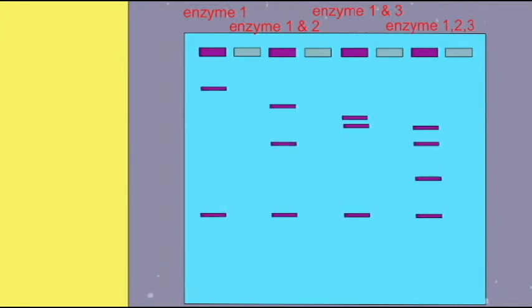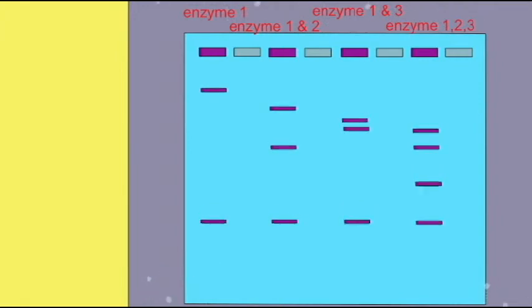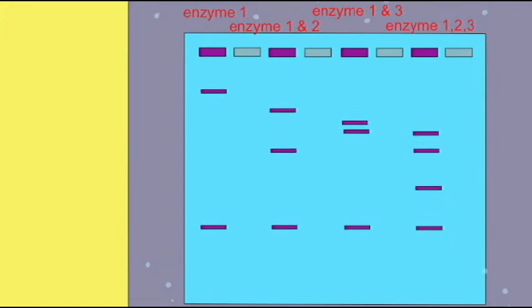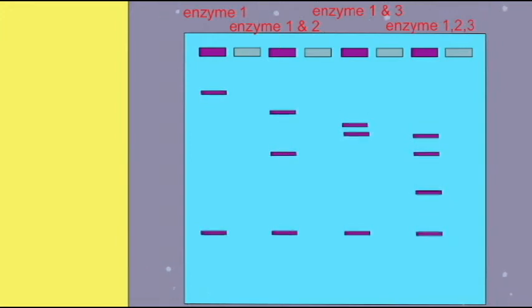So enzyme 3 makes one additional cut. Its cut is closer to the middle of that original yellow piece because those two bands are closer in size.